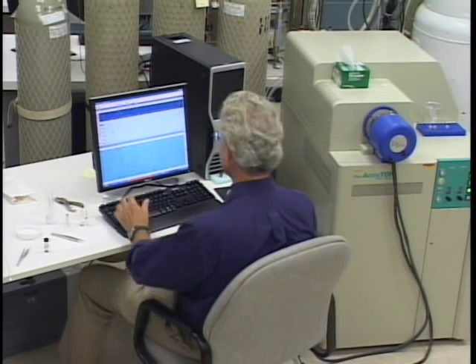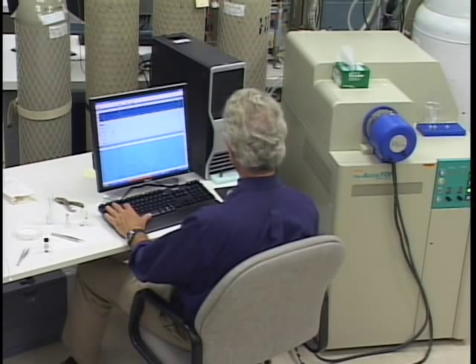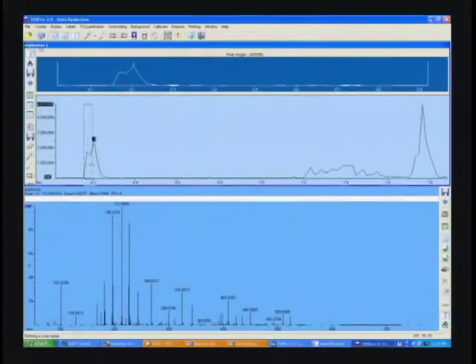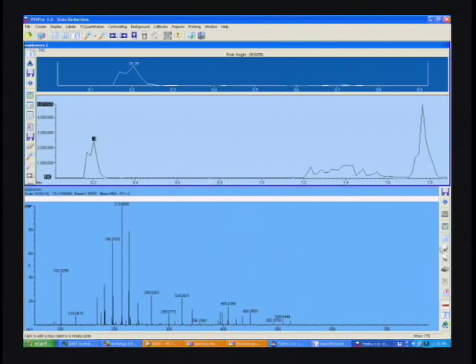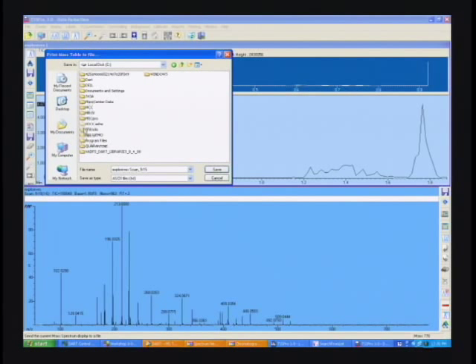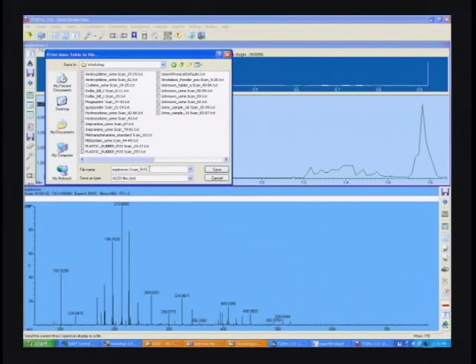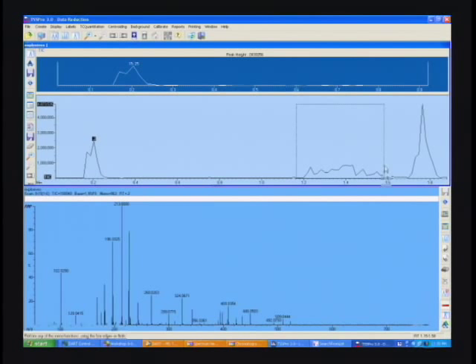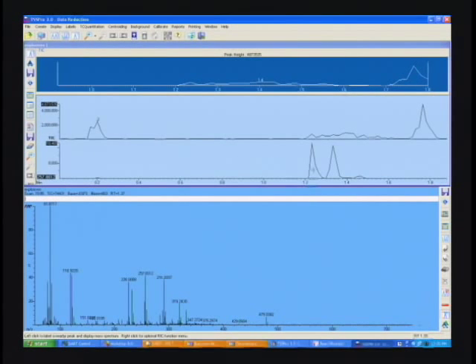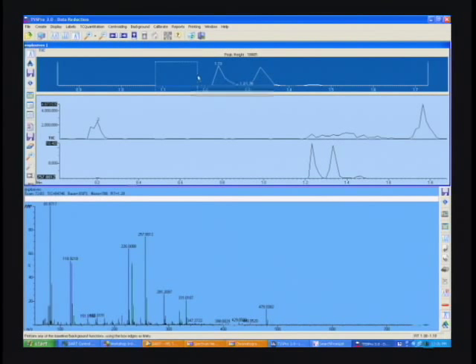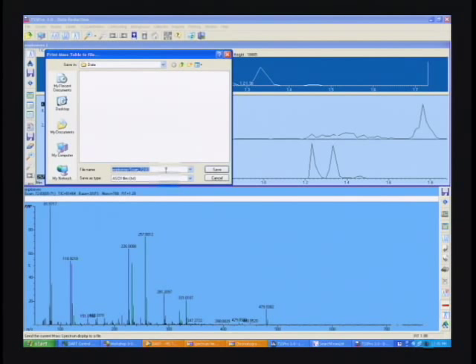Let's see what we can find here. Well, let's save both of these data files to see what we're finding here. We measured this twice, once without the methylene chloride and once with the methylene chloride. So let's go ahead and save the file without the methylene chloride first. Save that to a data file and put it in the same directory. Now let's put a note on the file name so that we know that there's no chloride. And then let's look at the part where we did add the methylene chloride. There are going to be some pretty characteristic peaks here. We'll put that in the same folder.